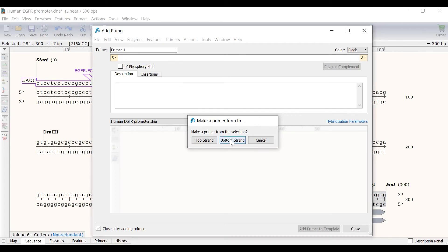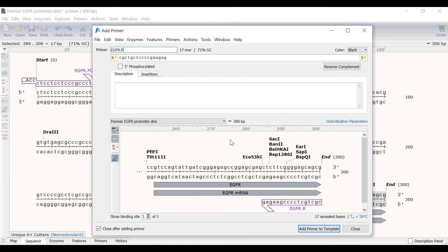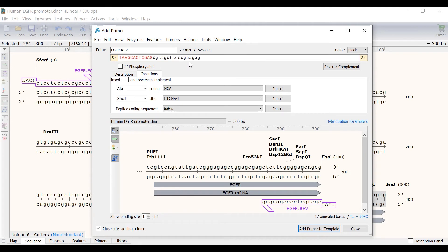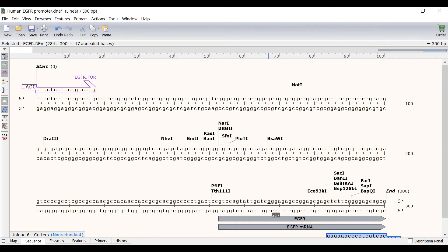This time I want to make a primer from the bottom strand. I will call this primer egfr.rev and I will also give it a short description. Now I will switch to the Insertions tab and click on the beginning of the primer sequence before selecting XHO1 from the drop down menu. As before I will click the Insert button to add this site. I will also manually add the bases TAAGCA to the 5' end to improve cutting efficiency, and finally I will select the Add Primer to Template button to add the primer to the file.